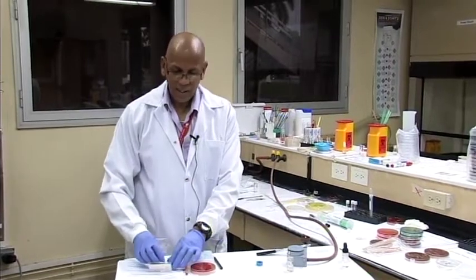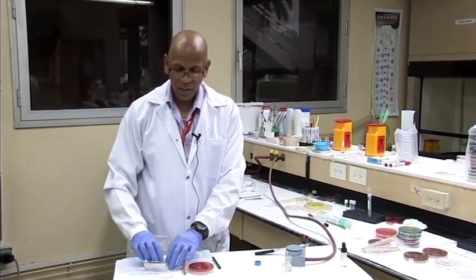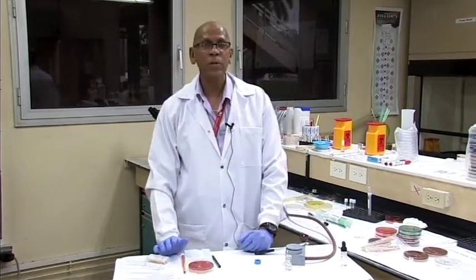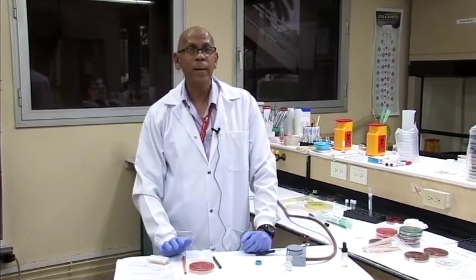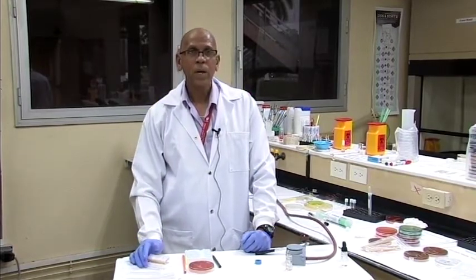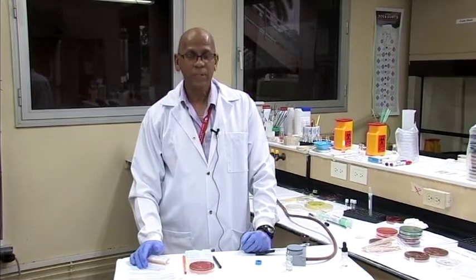A third type of wet preparation involves something called an India ink preparation, which we'll demonstrate when we're doing CSFs. So the India ink preparation is also another form of a wet preparation. Now we go on to actually doing a Gram stain.